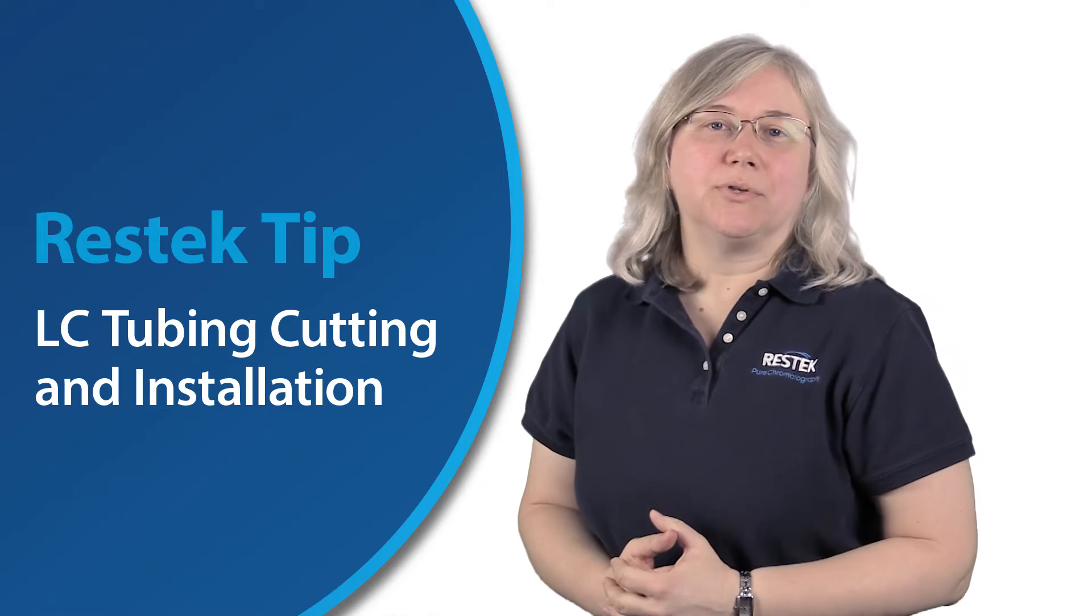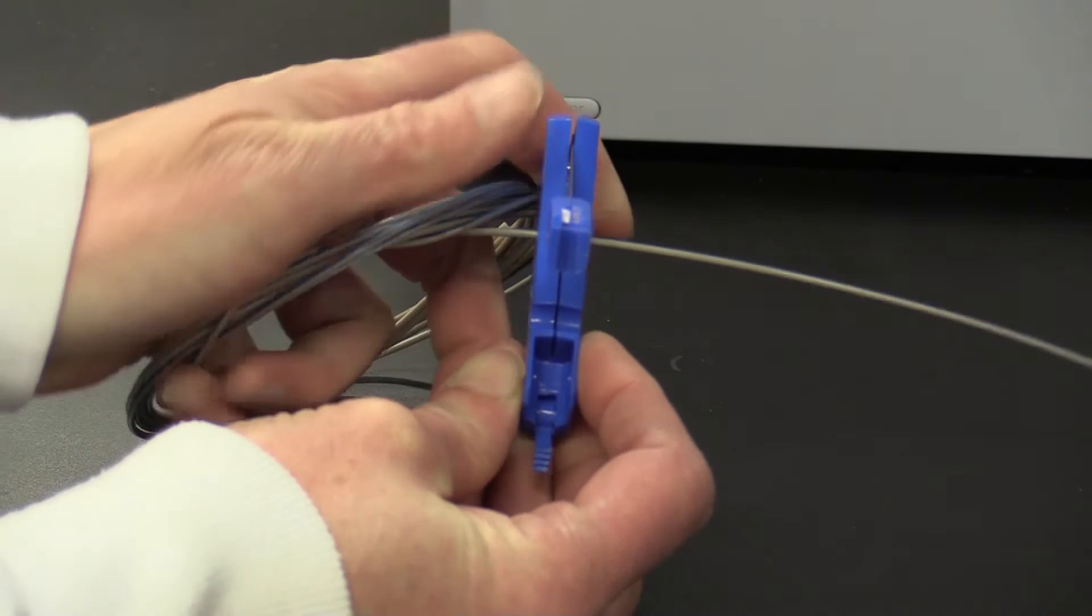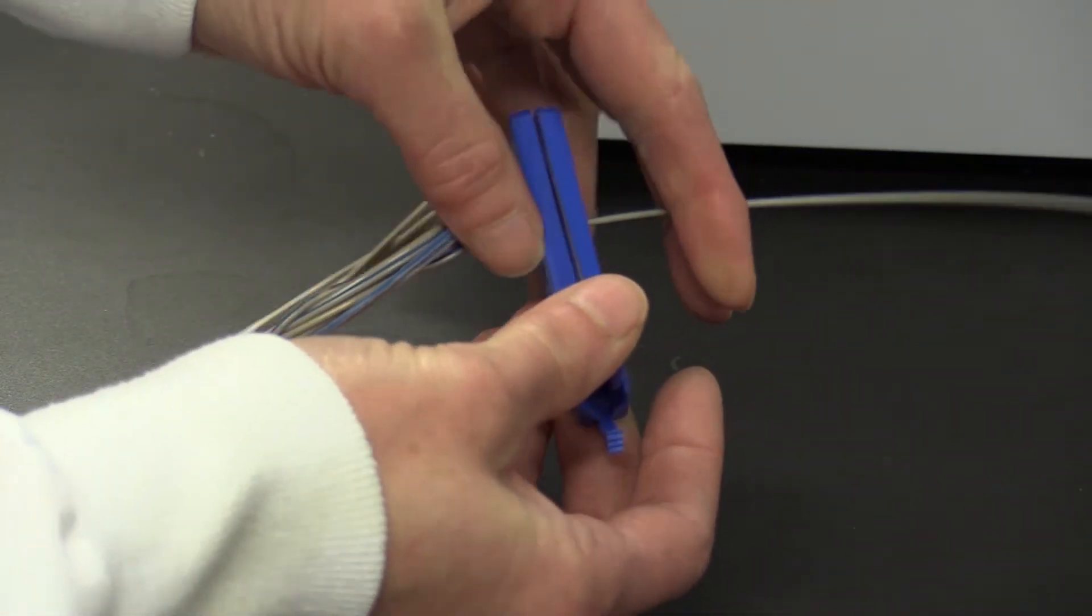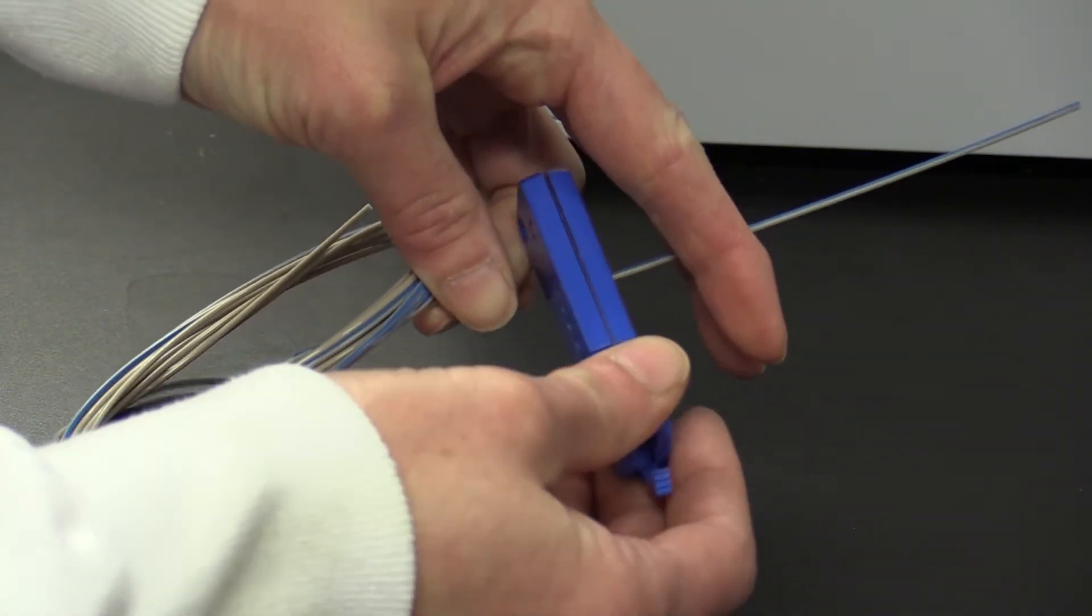You're probably familiar with the two types of tubing most commonly used for LC plumbing. The first is PEEK tubing, and when you're working with this, you always want to cut it with a guillotine-type cutter, not a razor blade and definitely not scissors.